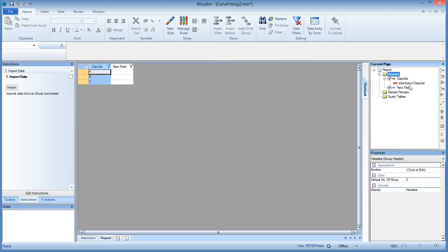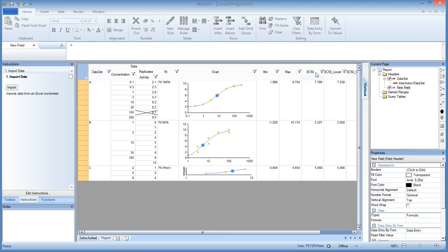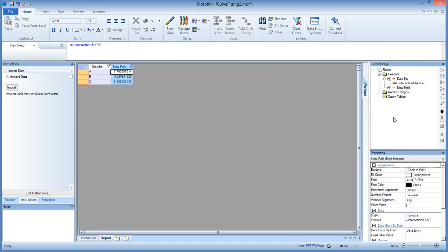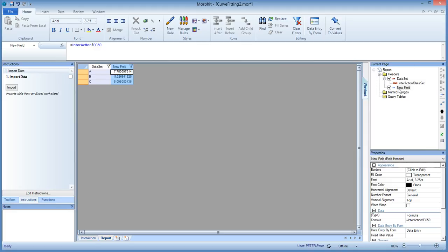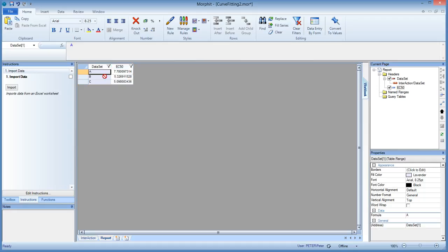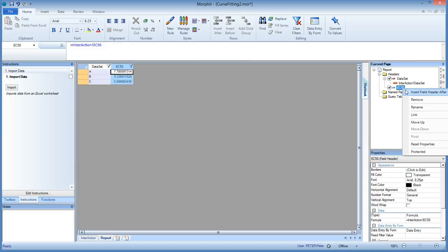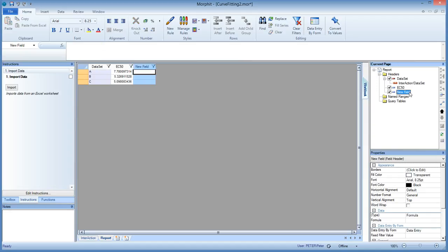And that is sufficient for Morfit to understand that you can add more fields. So we use a formula now to bring back the EC50. You see, so this is as simple as it gets. Morfit understands that by having this borrow, that it should bring in this value of 7.78 in the A data field. So there is a straight connection between those two tables now. And we can also bring in the EC50 upper or lower and the upper.